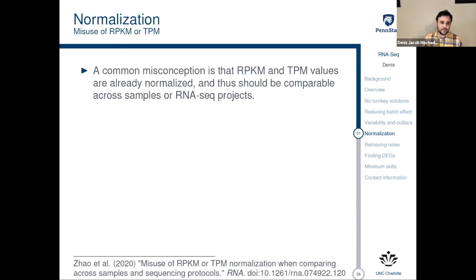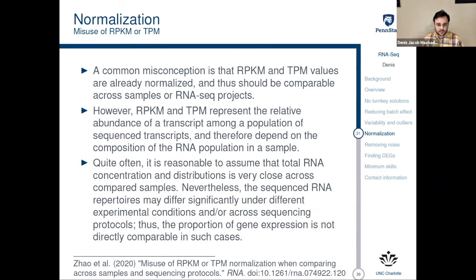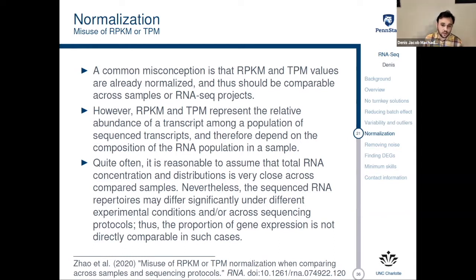A common misconception is that RPKM and TPM values are already normalized and should be compared across samples or RNA-seq projects. However, RPKM and TPM represent the relative abundance of a transcript among the population of sequenced transcripts and therefore depend on the composition of the RNA population in the sample. The sequence RNA repertoires may differ significantly under different experimental conditions or across sequencing protocols, so the proportion of gene expression is not directly comparable in such cases. I recommend reading Zhao et al. 2020 — 'Misuse of RPKM or TPM normalization when comparing across samples and sequencing protocols' — to understand this deeper. This is one of the most common reasons why I reject papers on RNA-seq.